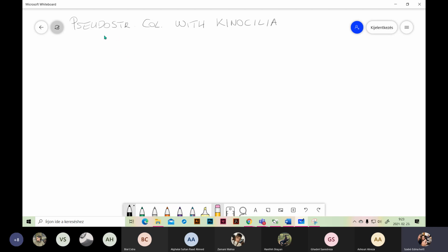This slide is from the epiglottis, and this slide is stained by PAS-H. The epiglottis belongs to the respiratory tract, and that's why in the respiratory tract we will see the respiratory epithelium, pseudostratified columnar with cilia.